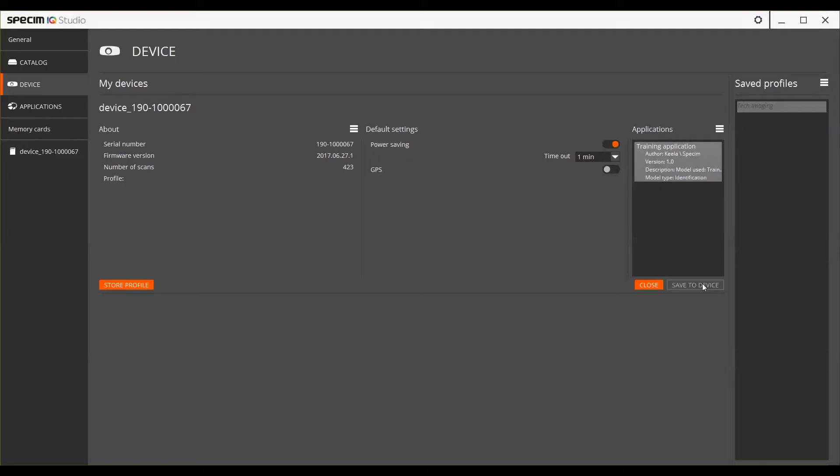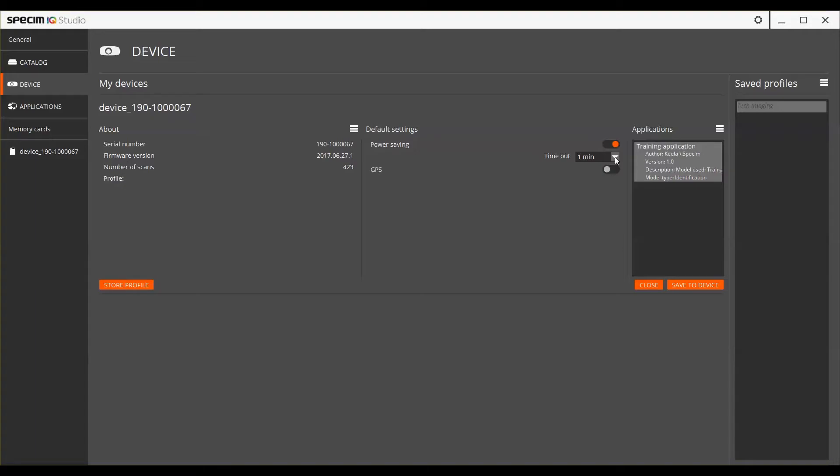Next, we can make some changes to the device settings. For example, you have the option of choosing whether the power saving is on or off. The power saving mode means that the device will go to a sleep mode in order to save battery. You can choose whether the device will sleep after 1 minute, 5 minutes or 10 minutes.